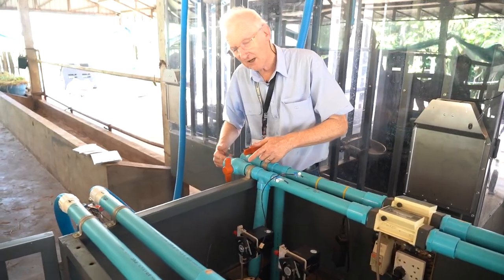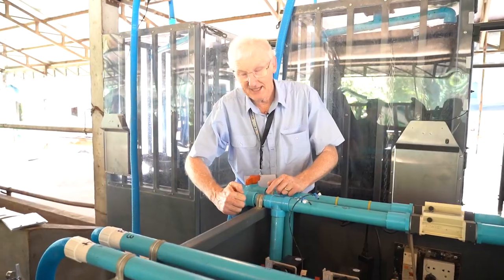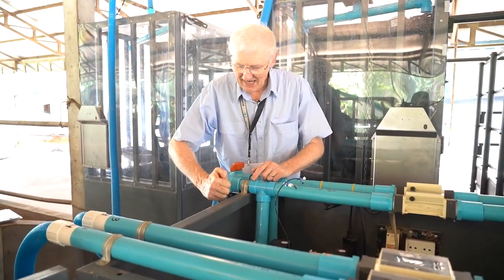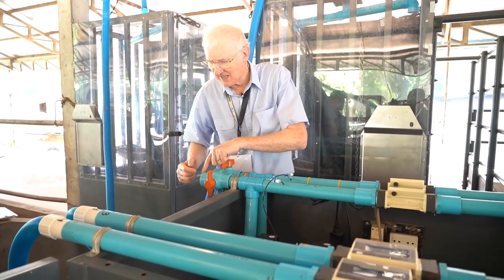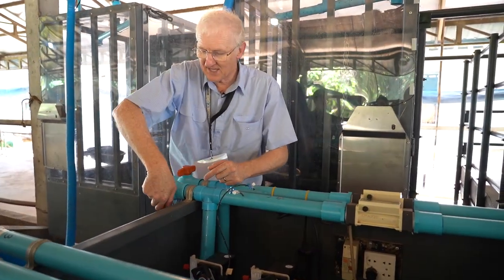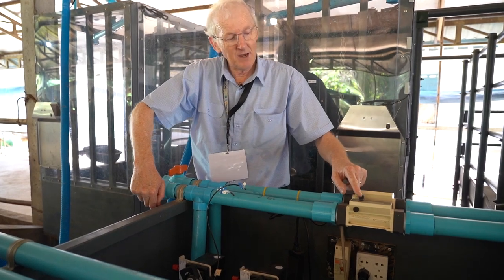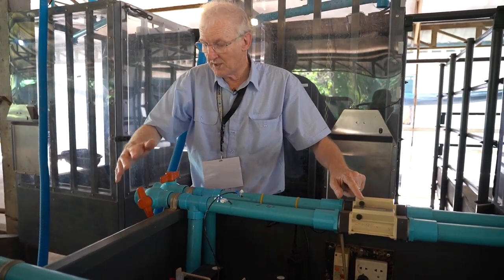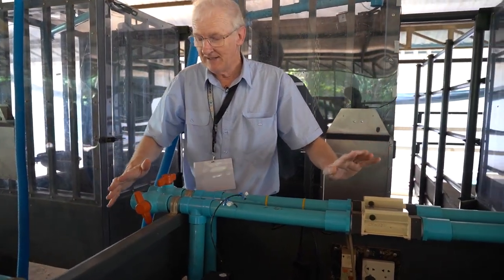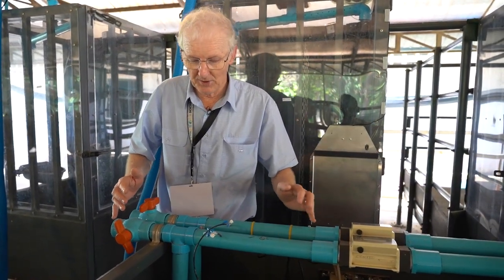What we do, there's a little T-piece ball valve here. It could be a gate valve. It is easier for the air to come here than it is to come all the way from the chamber. So if I start to open this, the flow rate here will drop. And when it drops to the value we want, we just leave that alone. And we are confident that it is pulling the right volume that we want.